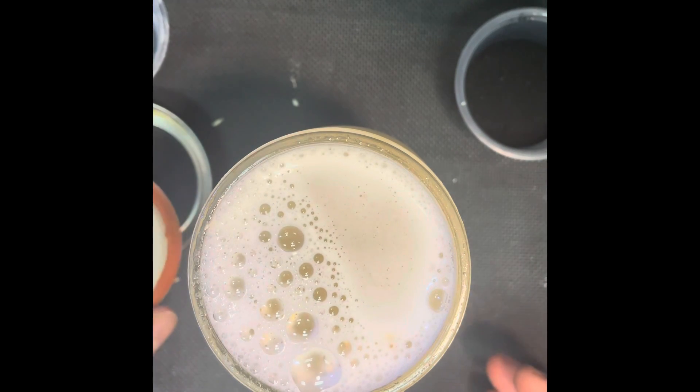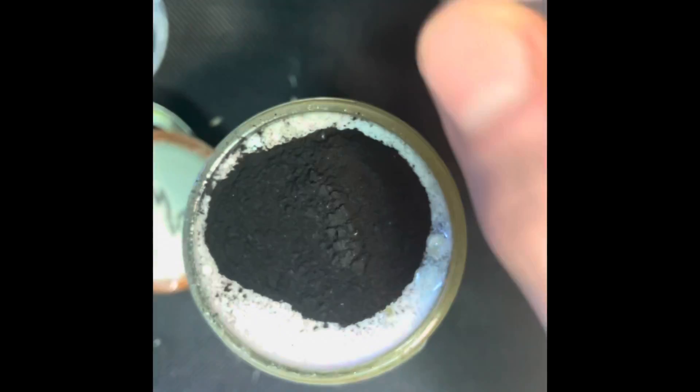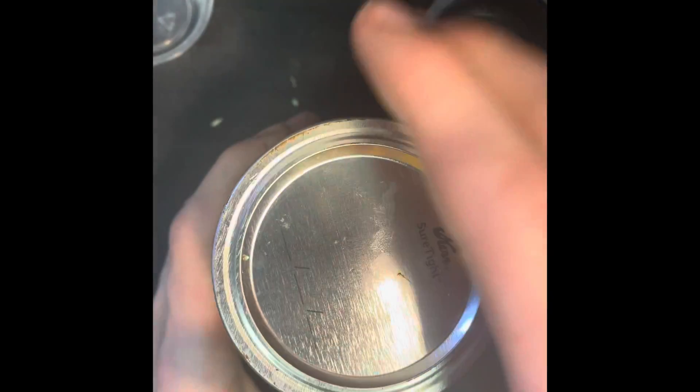If your jar doesn't hold everything and it starts overfilling, adjust accordingly. Then screw on the lid and give it a really good shake until everything is dissolved. If you want to make it into black agar, screw off the lid and dump the 5 grams of activated charcoal inside the agar you just made. Then close the lid, screw it on very well, and give it a really nice shake again.